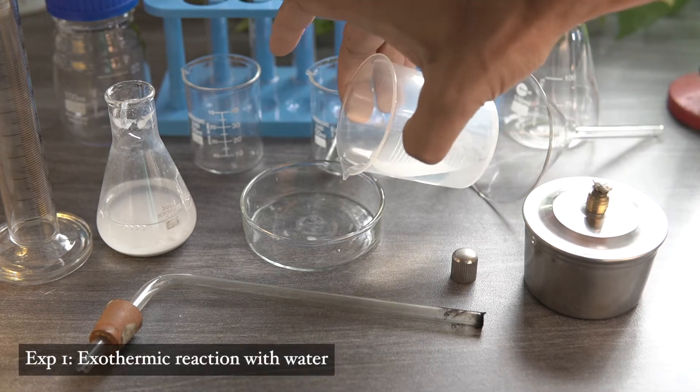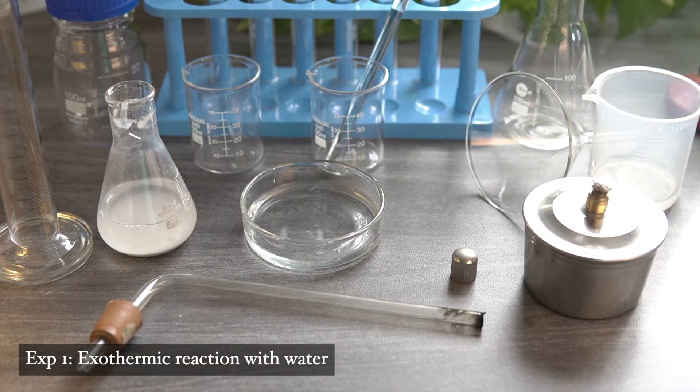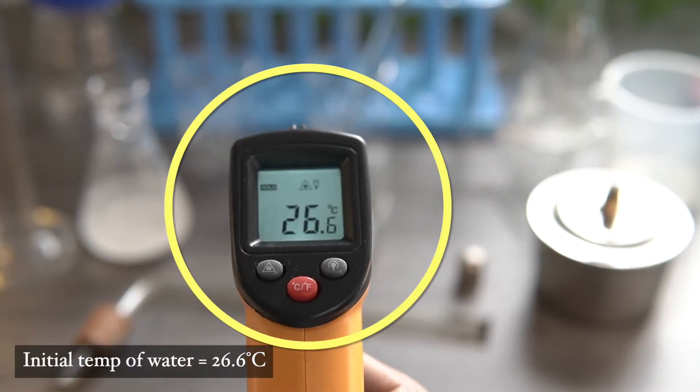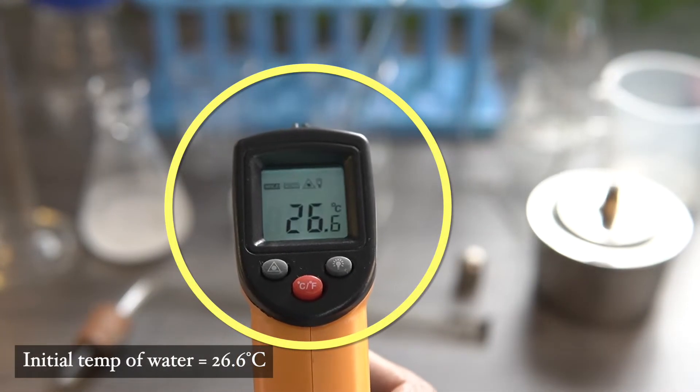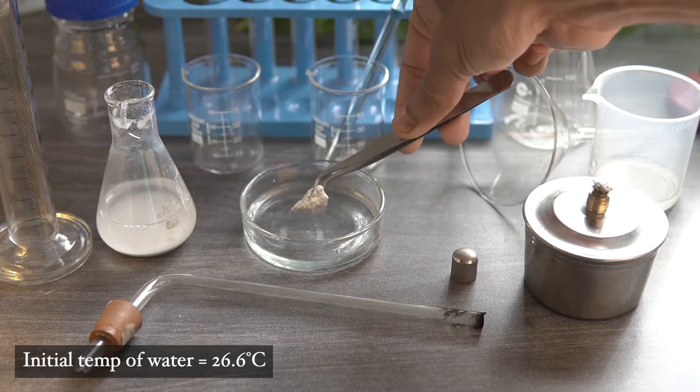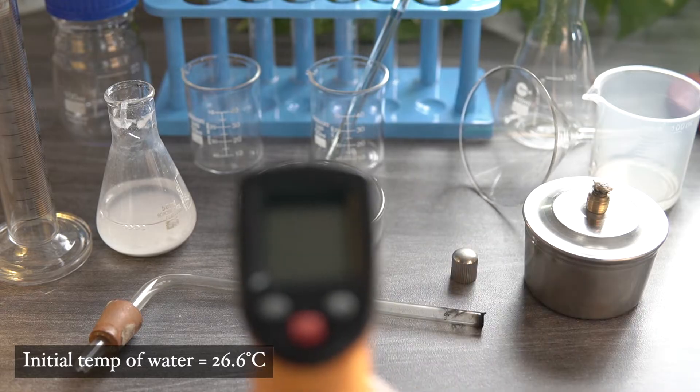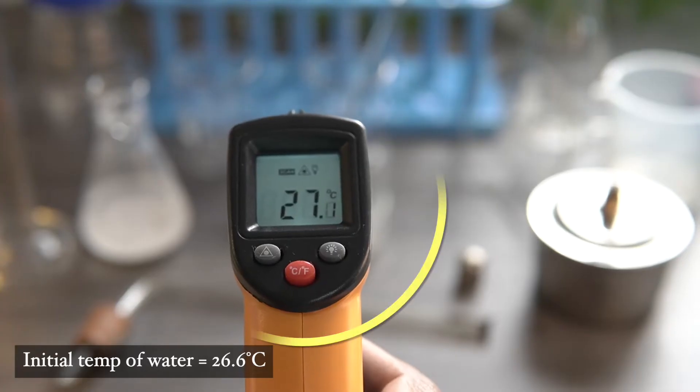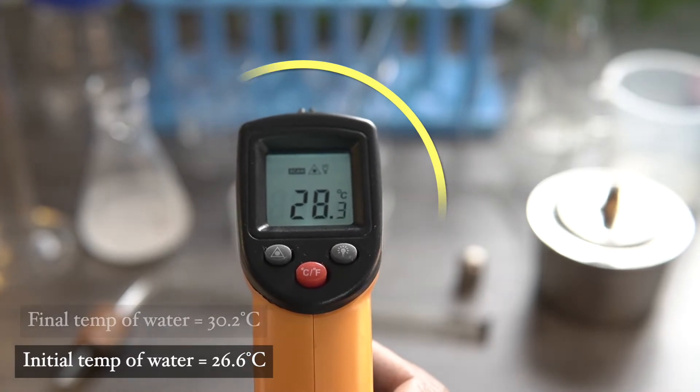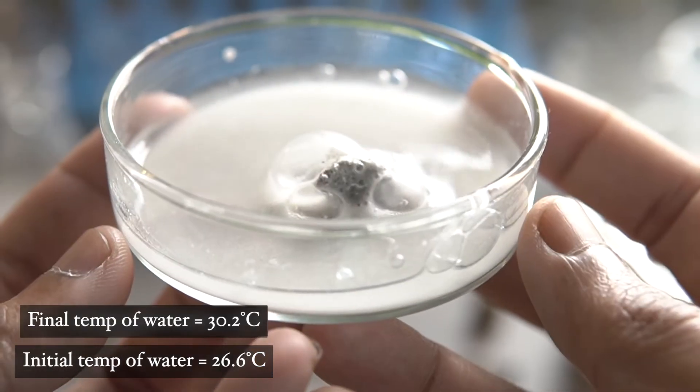We are taking some water in a petri dish and record the initial temperature of water. It's about 26.6 degrees Celsius. Now we will add a small piece of calcium carbide in water and try to record the temperature of the solution. We will see that the temperature is gradually rising, which indicates that the reaction is highly exothermic in nature.